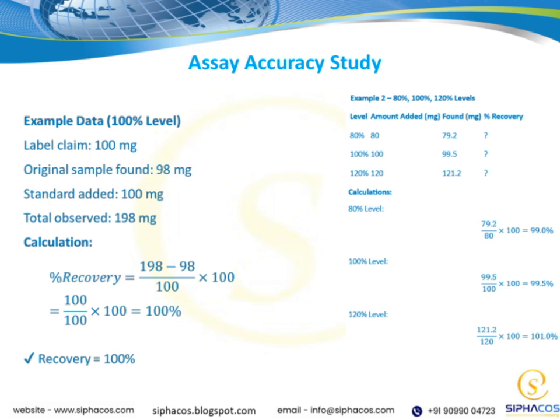This helps us identify any discrepancies and assess the overall performance. The key points here are accuracy, reproducibility, and consistency across different samples and conditions. By thoroughly analyzing these factors, we can confirm that our assay is suitable for its intended purpose. This validation step connects directly to our broader goal of delivering high-quality, dependable testing solutions.